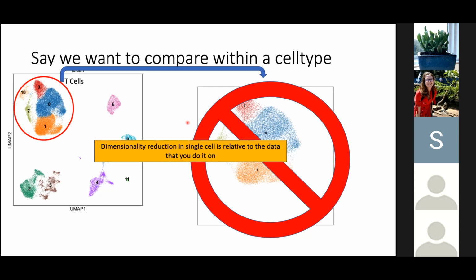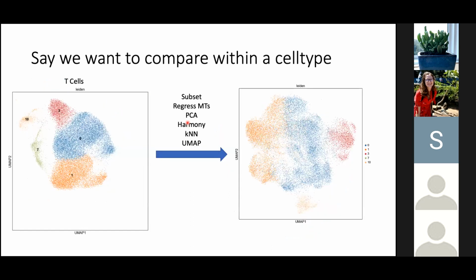The more data you have, typically, the more clusters you're going to get. So that just gives you an example. It's really important to always redo these analyses based on the data that you're interested in looking at. This is not a perfect example, but what you notice is these clusters kind of look similar, like this guy is probably this one.